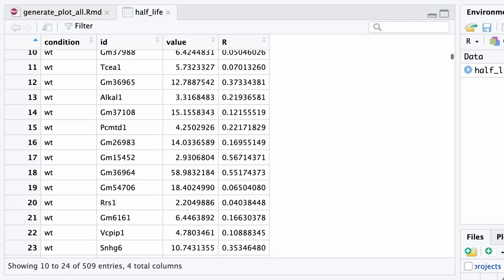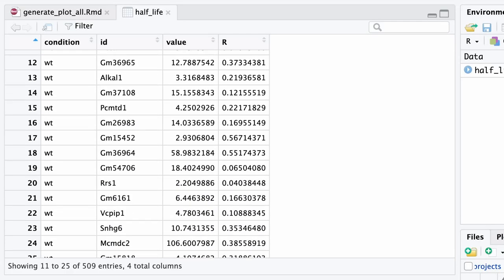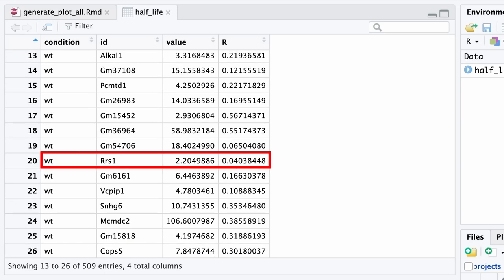For example, we have the Rrs1 gene here with a good fit and a half-life of around two hours. I will use this gene as an example of what to expect from your raw data.